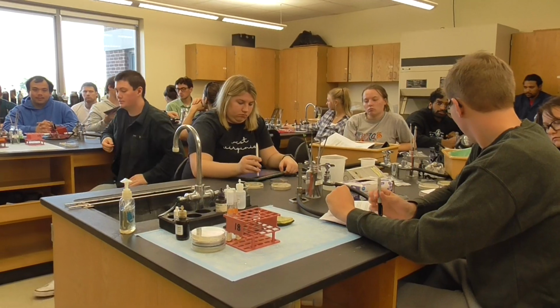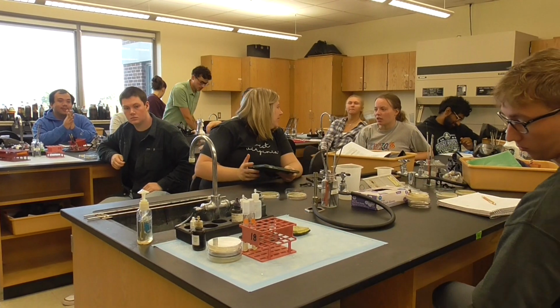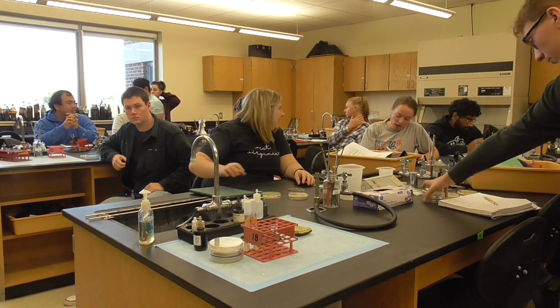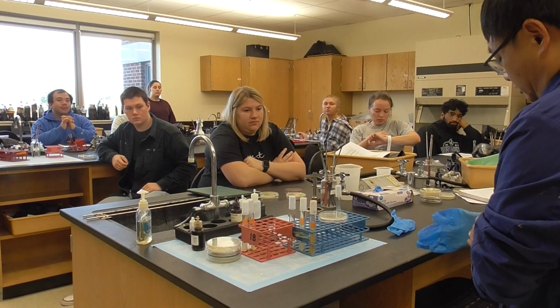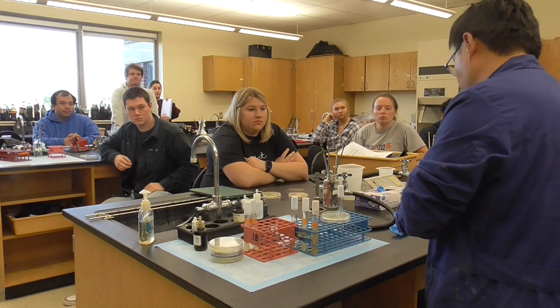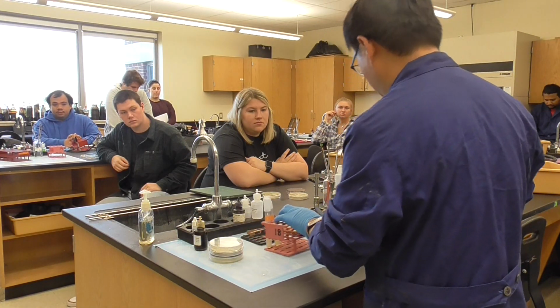Okay, now, again, everybody come in here. We're going to show you how to do it. Same thing. I need to show you because there's lots of stuff there. It's going to confuse you. You have Bacillus, Citrobacter, right here. Okay, what are we going to do? You can choose to use a plastic loop or metal loop, it's up to you. I don't really force you to choose one, okay? Let's do something easy. Let's show you the important one first.